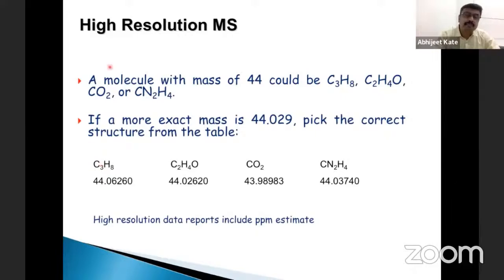There are 4 compounds with the mass 44. Now, if you take 12 as the atomic mass for carbon and 1 for hydrogen, this total would be 44. Same thing for this: if you add 16 for oxygen, 4 for hydrogen, that is 20, and 24 for carbon, because 12 for each, so 24.